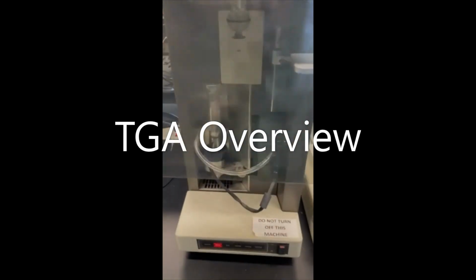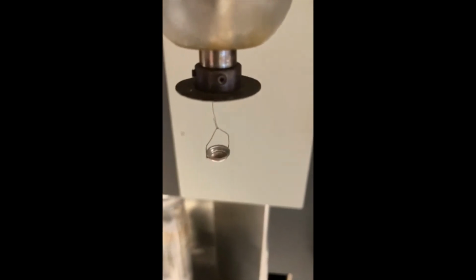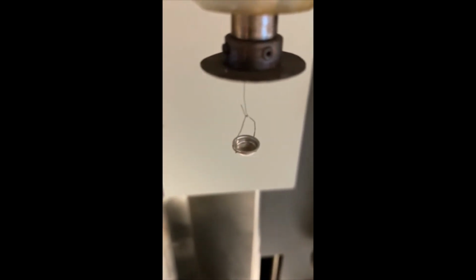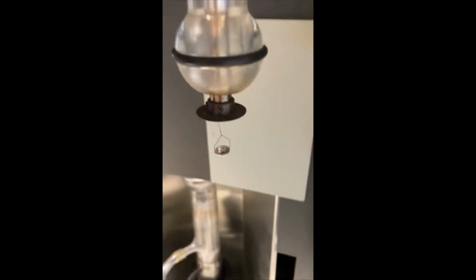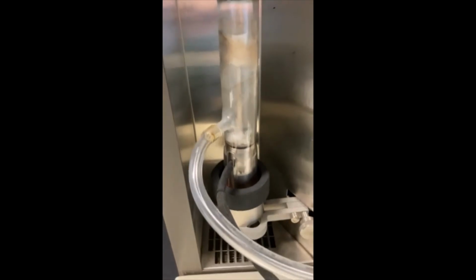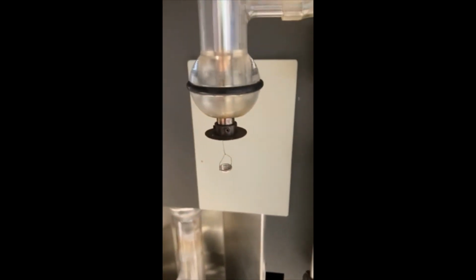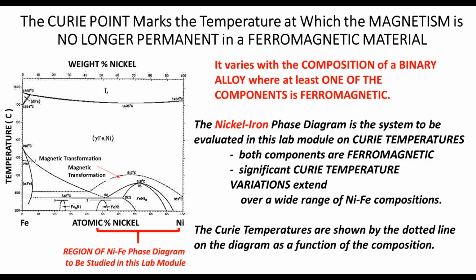Finally, this experiment is to be repeated for each of the remaining iron-nickel samples in an identical manner to what we did here. Then, the resulting Curie temperature data, as a function of composition, should be plotted against the existing phase diagram data for the Curie temperature curve on the iron-nickel phase diagram.